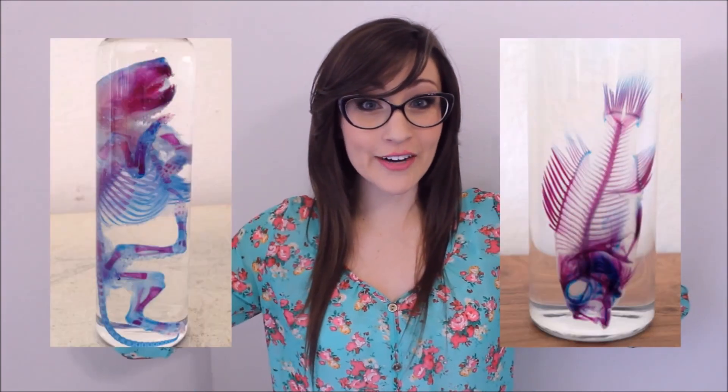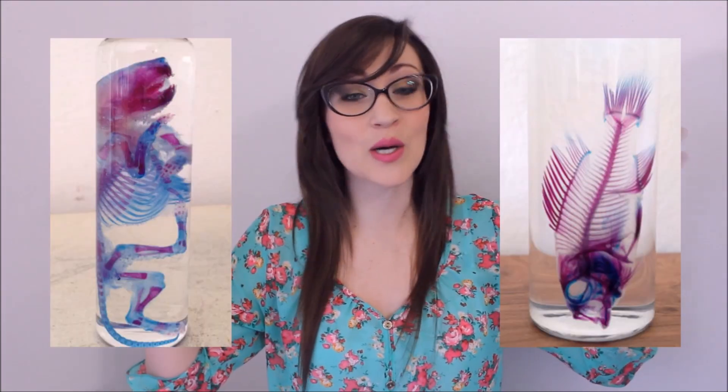Diaphanization is also known as clearing and staining. We're going to be clearing the specimens — rendering them very transparent — and staining their bones and cartilage two different colors with a few different chemicals. If you've never seen a diaphanized specimen, here are some pictures of a few that I found online.